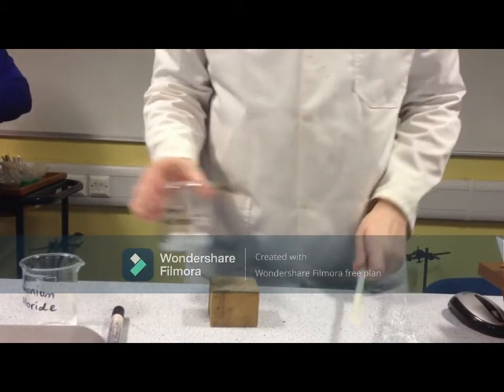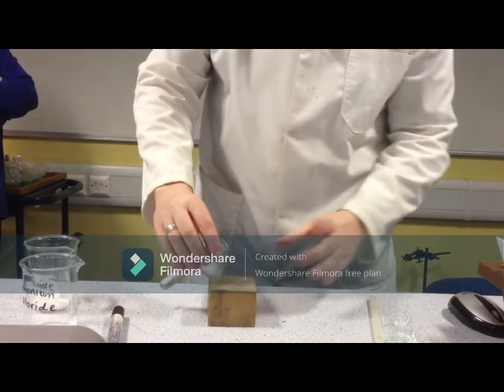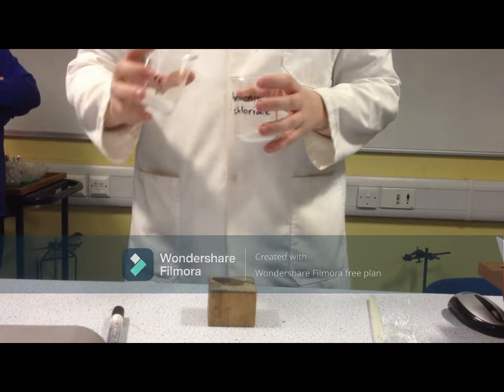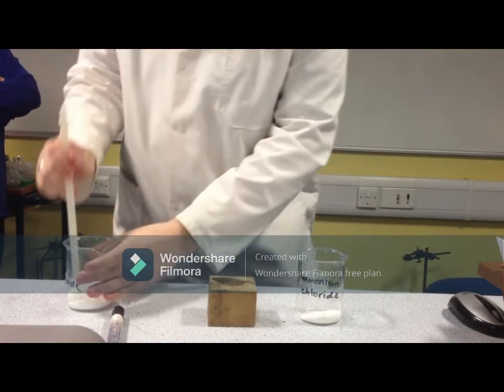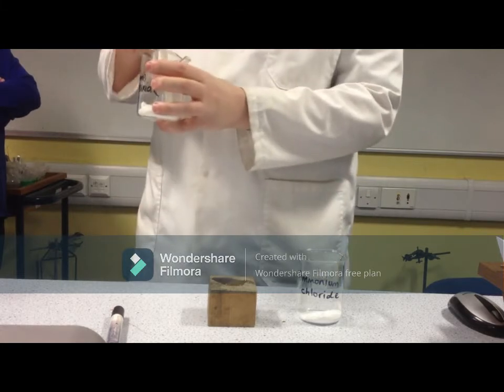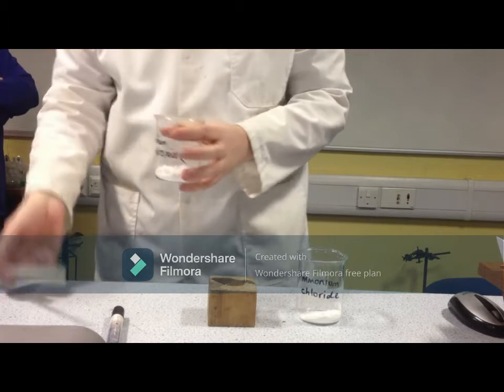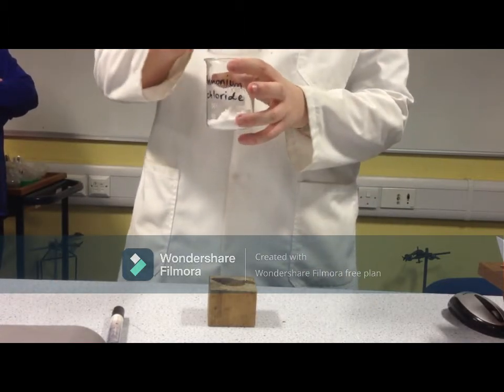So, water was actually added below the beaker. The reason is to show the effect of the endothermic reaction where heat is absorbed from the surroundings, causing the water to become ice. As the water freezes, the beaker that was placed above it will be stuck on it.